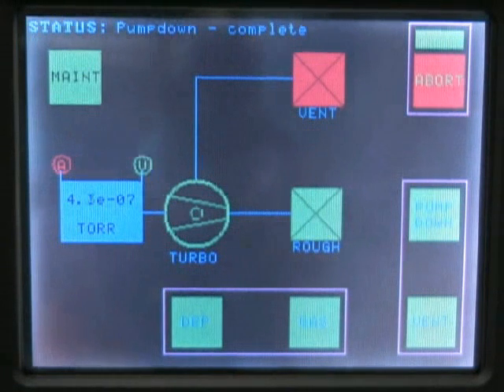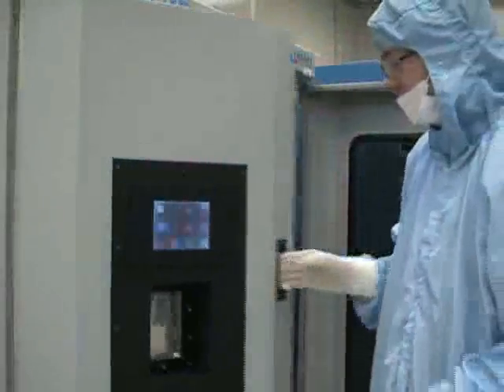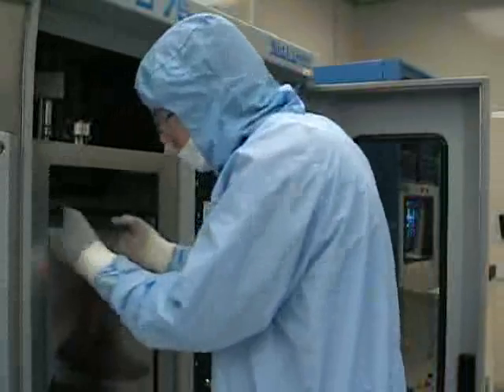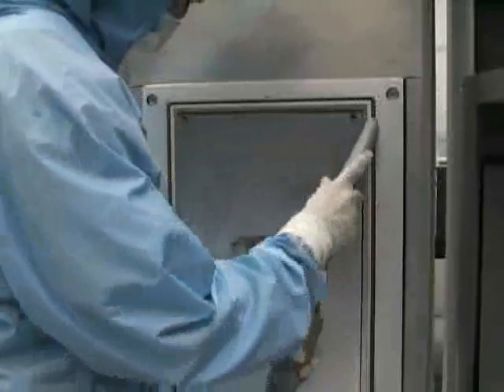Before you begin venting the system, you should wait 15 minutes after shutting the filament off. To begin venting, press the vent button on the front panel touch screen. Once the touch screen displays vent complete, you may open the chamber door and retrieve your sample. Remove the platen from the chamber, unscrew the spring clips, and remove your sample. You should then open the shutter by entering the DEP menu and pressing the shutter 1 button on the front panel touch screen. At this point, remove the tungsten boat from the electrode pair — note that the shielding between the electrodes and the boat itself may still be hot. Upon completion of your run, clean the chamber with a soft tip vacuum so that the system will be ready for the next user.